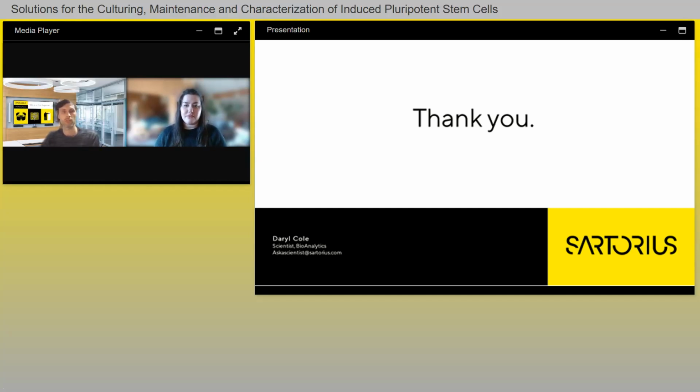Okay, great, thank you. Another question asks, how can we visualize stem cell differentiation using your analyzer? I'm guessing you mean the iQue by the analyzer. We've done this using a multitude of different stem cell or differentiation markers.